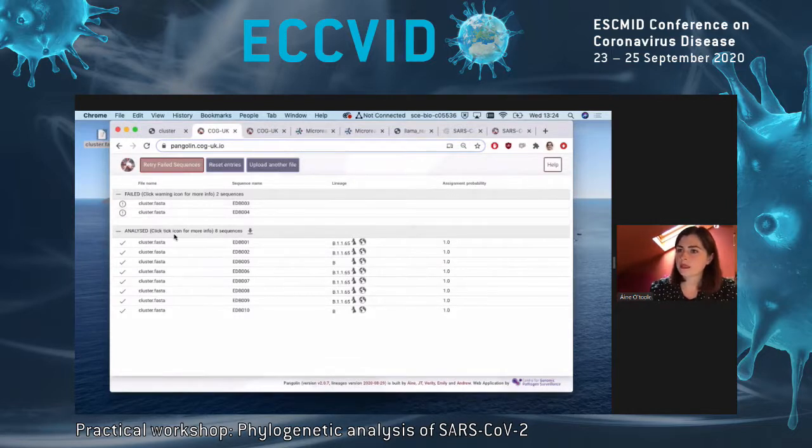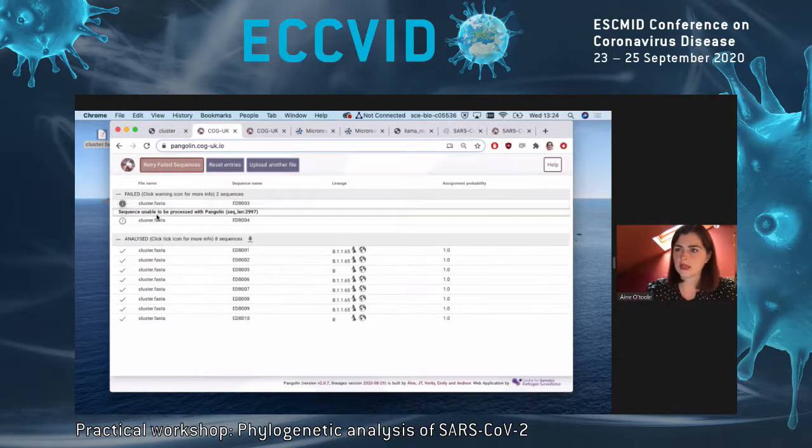Okay, so here we can see we've got a couple of failed sequences, and 8 sequences that have been assigned a lineage. To get information about why the sequences may have failed, you can click on the message tab.